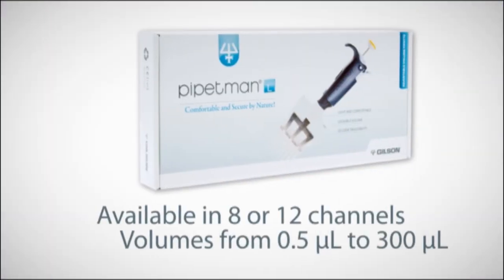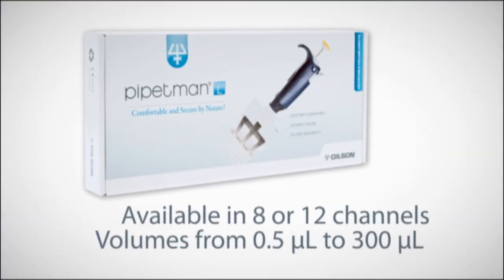Four models of Pipet-Man L multi-channel are available in eight or twelve channels.